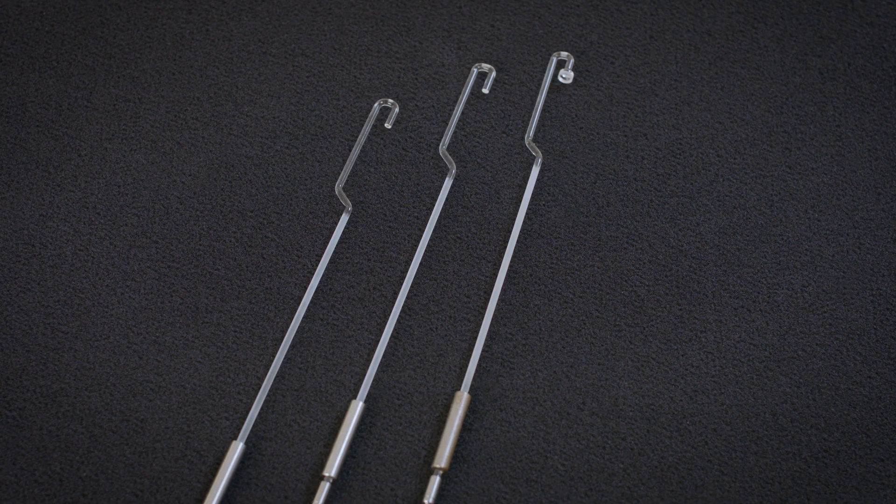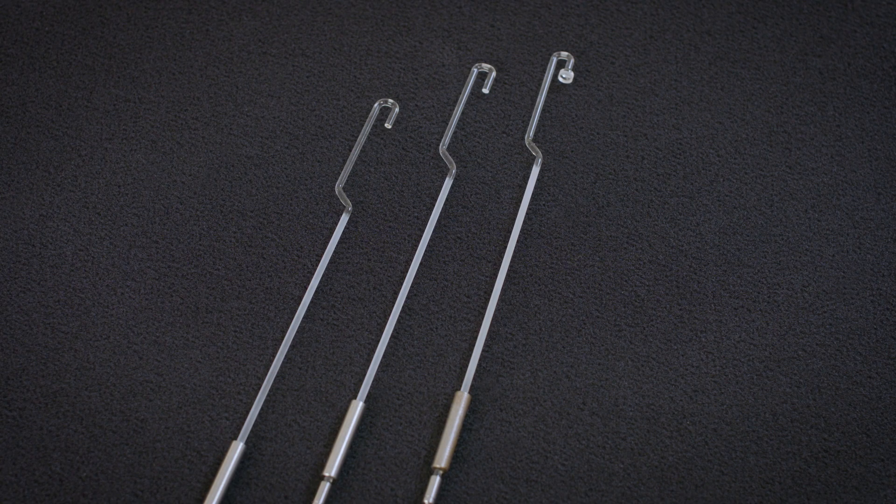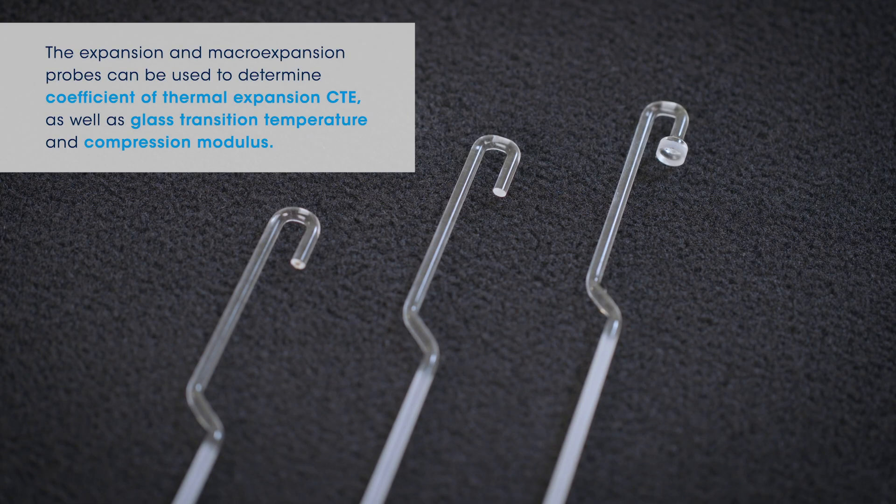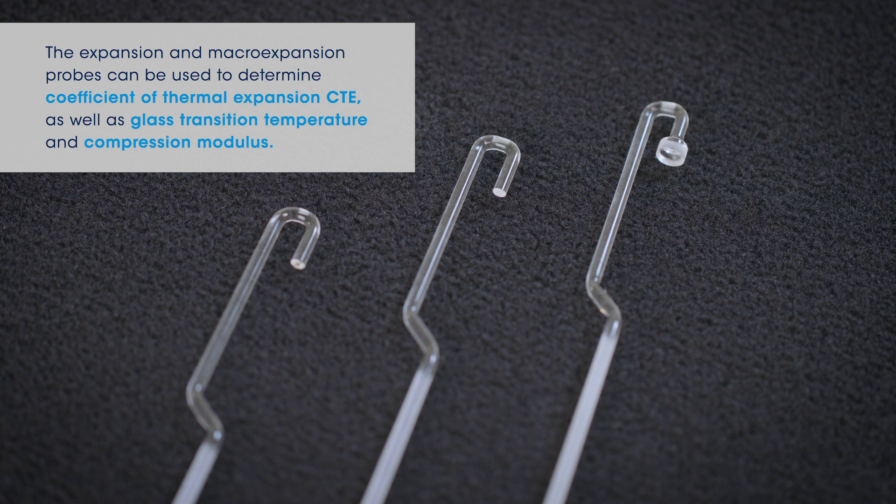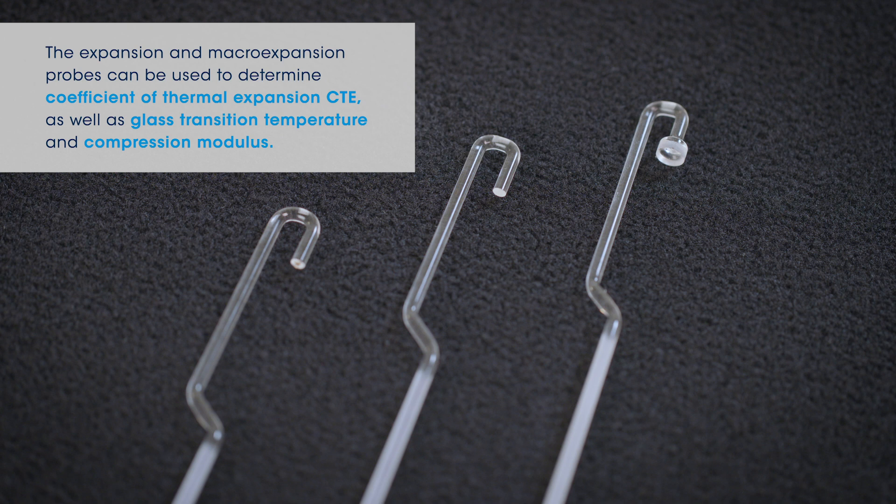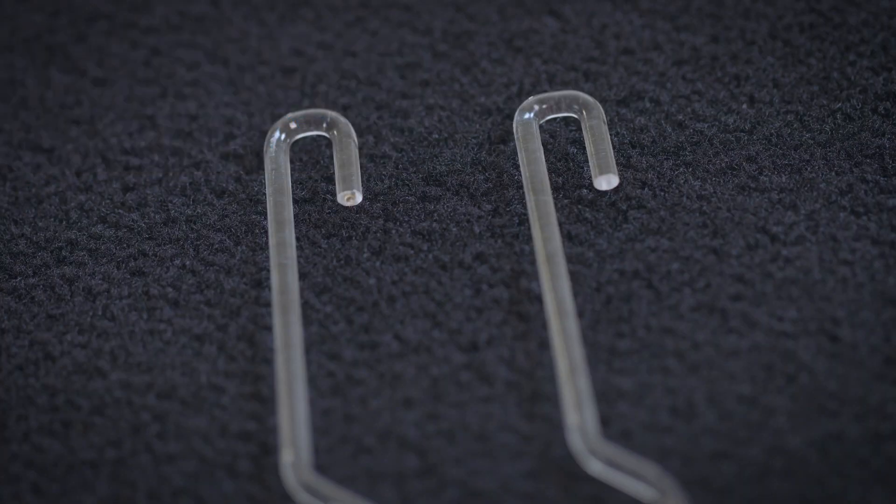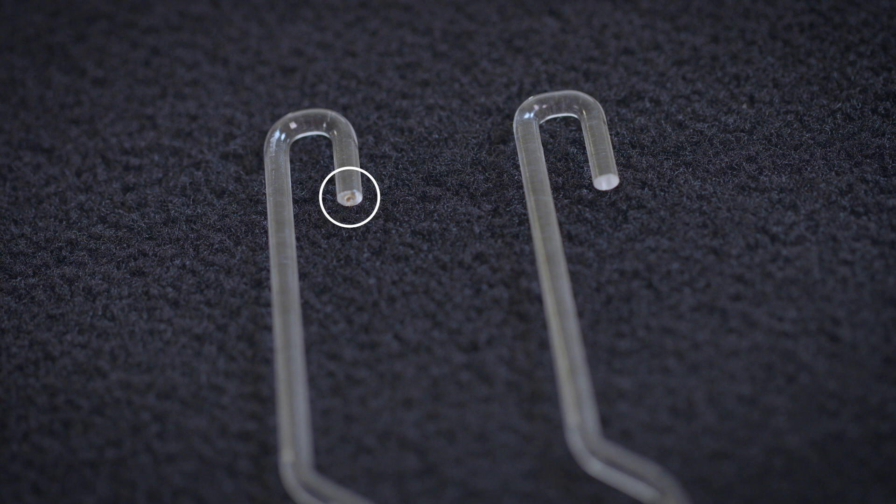The type of probe you choose depends upon the type of testing information you need. The expansion and macro-expansion probes can be used to determine coefficient of thermal expansion as well as glass transition temperature and compression modulus. The penetration probe has a small tip that sinks into the material as it is heated. This probe is used to determine glass transition, softening, and melting points.